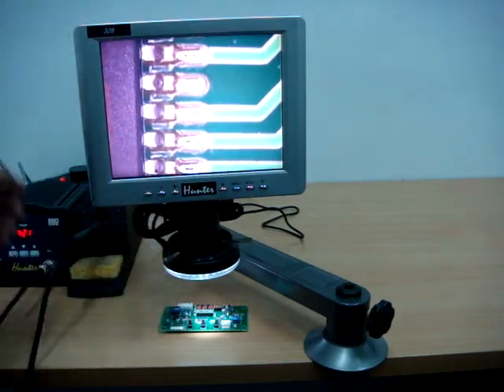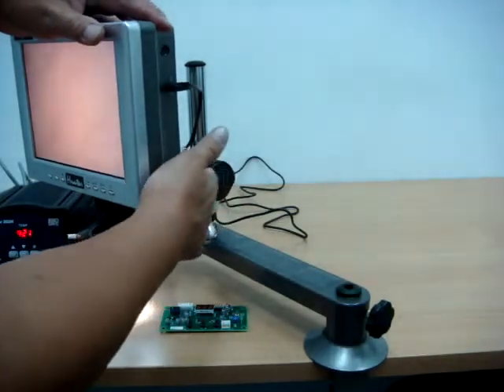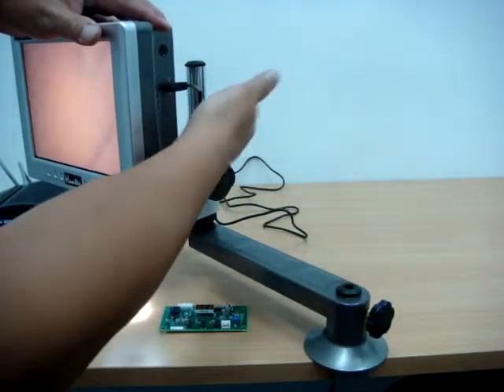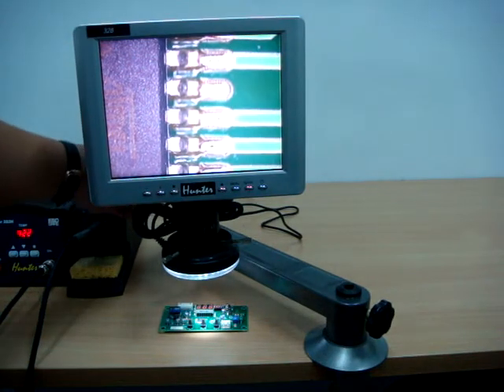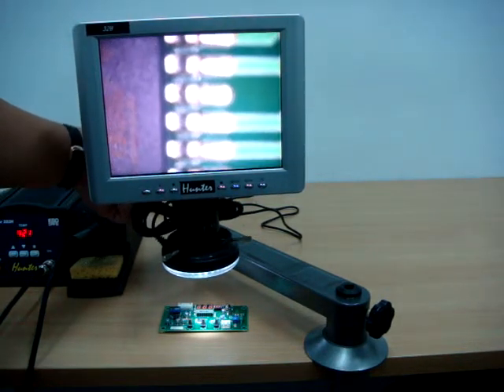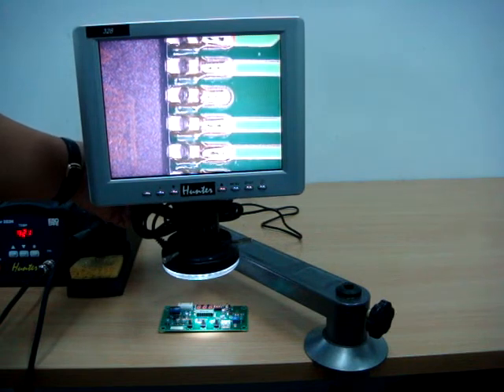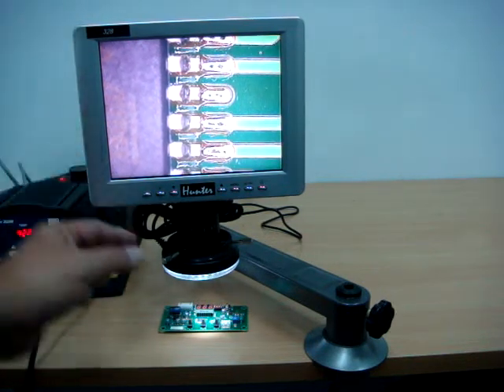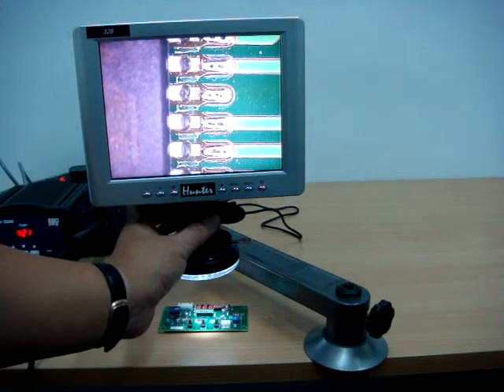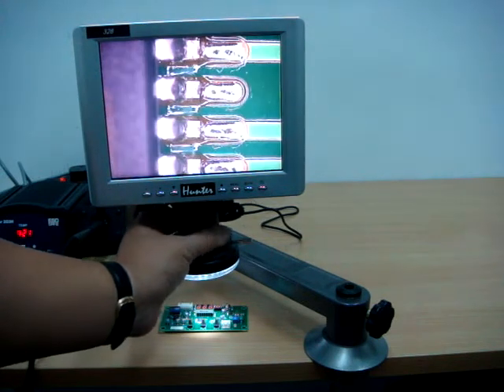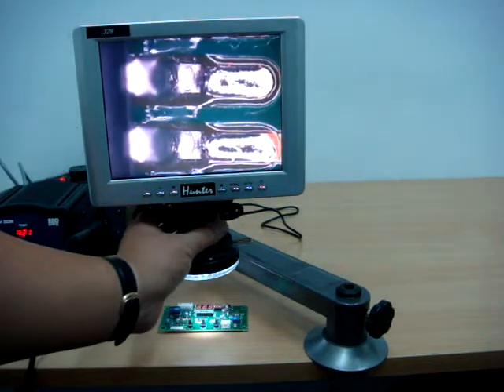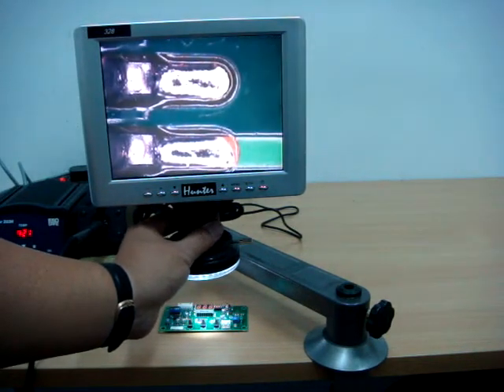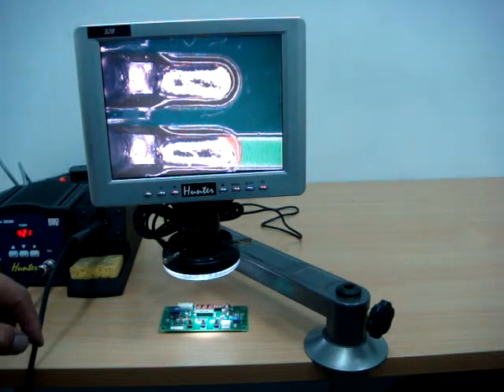Behind this area is for you to adjust the height for focusing. You just tune - focusing can be blurred or sharp, so you adjust it. The minimum is 10 times until a maximum of 100 times, so you can check very clearly on the leg components.